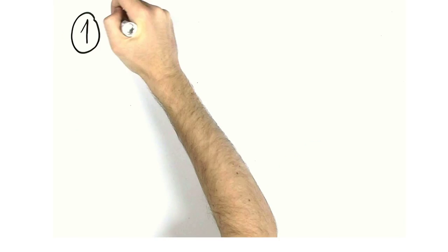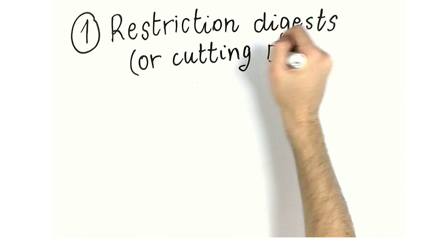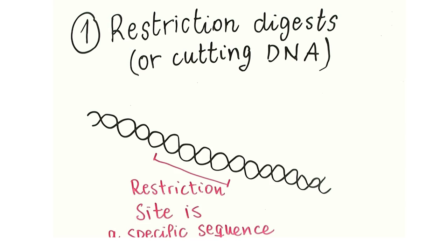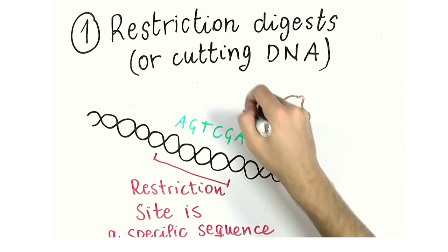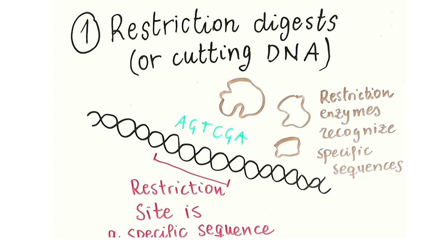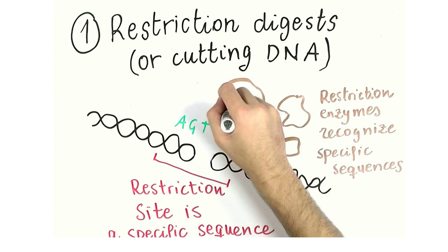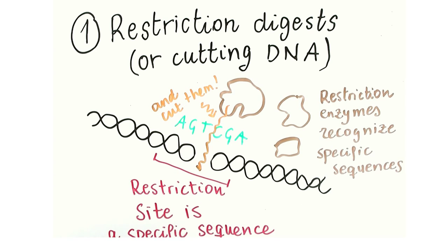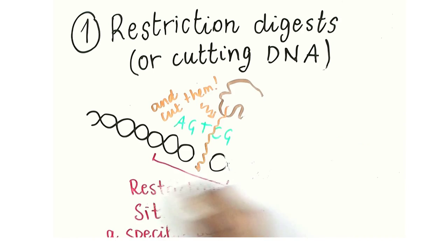1. Restriction digest, or cutting DNA. In this process, you cut DNA strands at specific sequences, called restriction sites, using proteins known as restriction enzymes. In a biobrick plasmid, there are very specific restriction sites on both sides of your gene of interest. By using specific restriction enzymes, you can cut out the gene of interest from its original plasmid backbone.